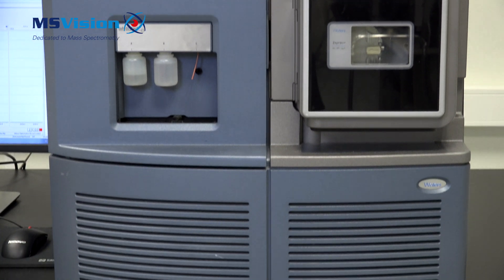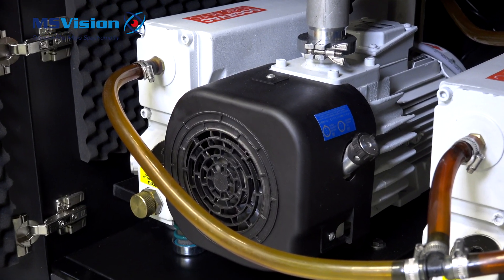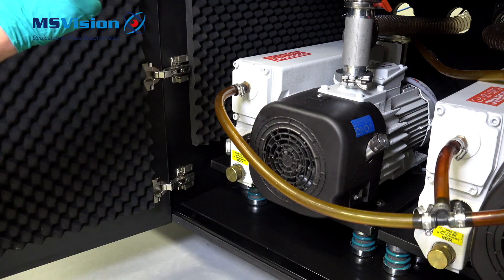Changing the oil in the 65 pump is more or less identical to the SP40 from Labold, which is used on the older versions of the Waters triple quads.